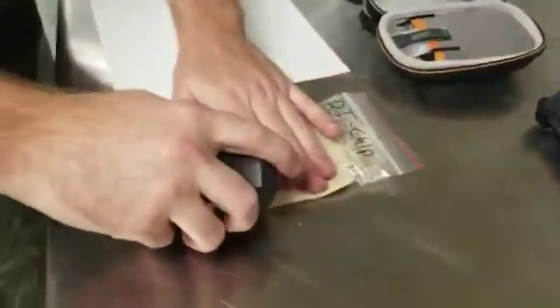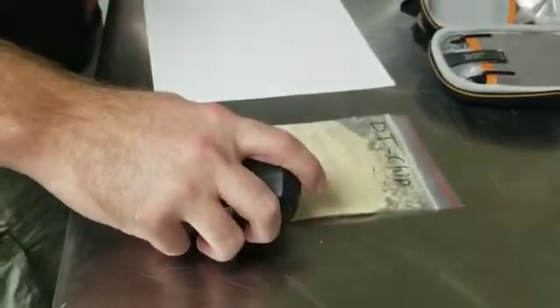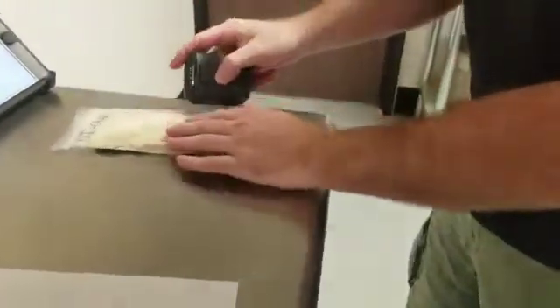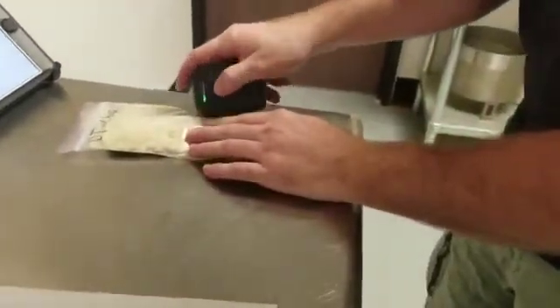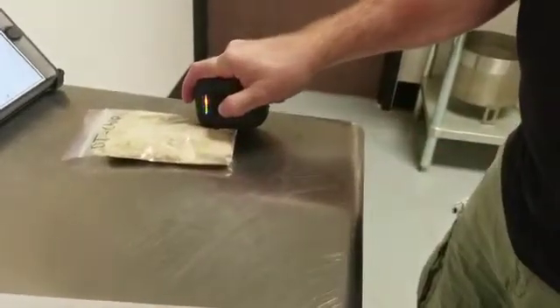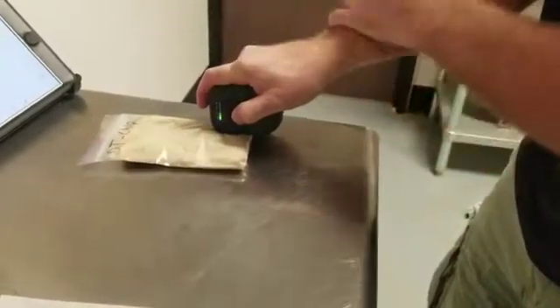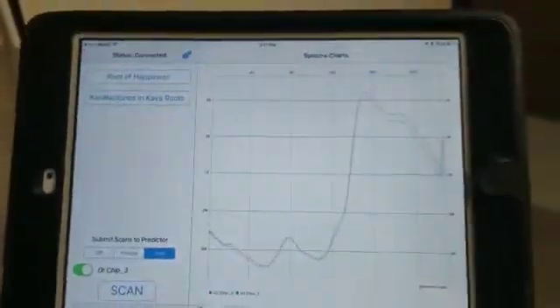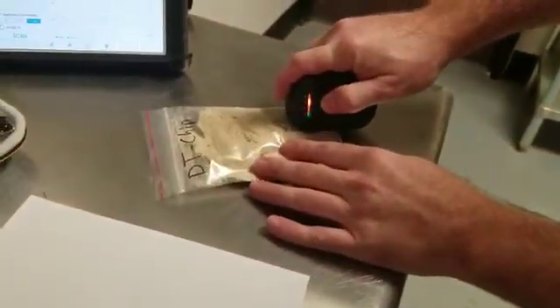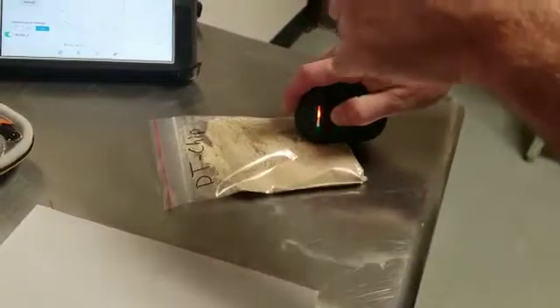So, we're just going to take five scans of this material. We'll start in one corner. You can see on the screen, the spectra. Let's help it this way so you get it better. There we go. You can see we're scanning.